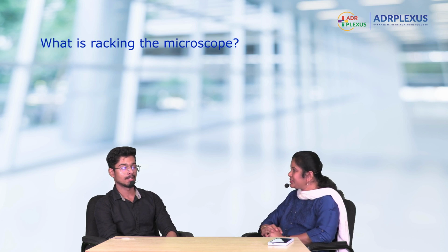Okay, fine. Another star question. What is racking the microscope? To visualize the three dimensions of the organisms, we do fine adjustment by moving it back and forth once the object is in focus. So this way, in fact, it can differentiate between dust particles and cells also. So that is called racking.